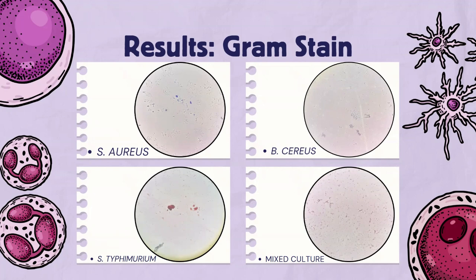In the Gram staining, we used iodine, and iodine acts as a mordant, which will bind the crystal violet to form a larger complex that gets trapped inside of the thick peptidoglycan layer of Gram-positive bacteria. So without it, we would have the crystal violet wash out during decolorization, which would make the Gram positive cells appear as though they are Gram negative, which would be inaccurate.